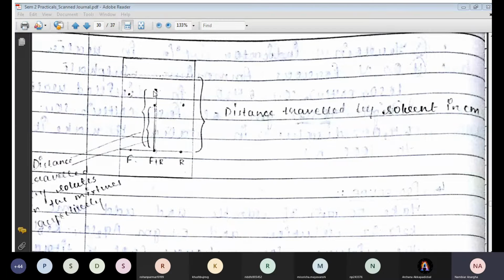अभी ये देखो ये ऊपर नीचे हो गया है, but however in actual case it is not like that. So here with standard we can know the separated mixture is for what component. समझ में आया. यहाँ पे F plus R we have spotted together and then it runs. After the run is completed, we can see a separation of mixture, and in that separation we can actually know कि which component is for what by comparing it with our standards.